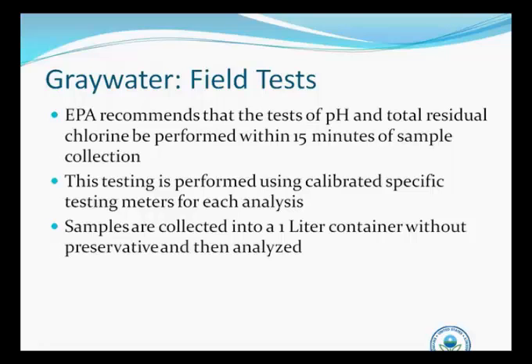As far as pH goes, there are also handheld meters that are adequate for this, but pH meters generally require frequent calibration, and it is very, very important to maintain a log of this and to perform these frequent calibrations in order to get accurate pH results. With both of these field tests, it's also really important to clean equipment in between samples so that you don't transfer any kind of contamination or influence the test because of something that was done previously.